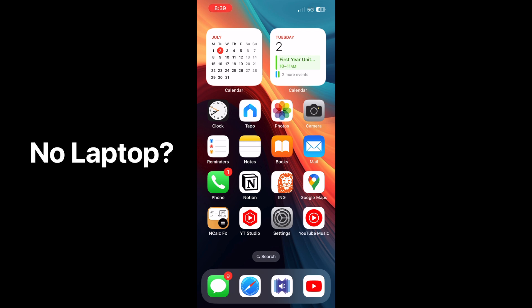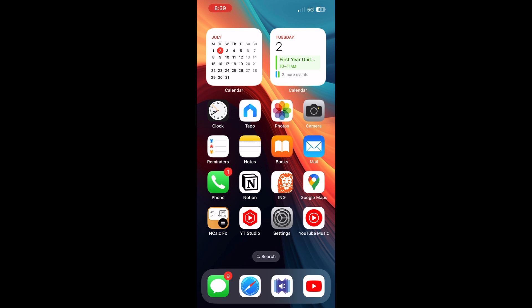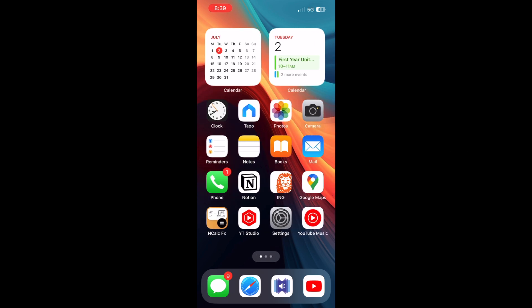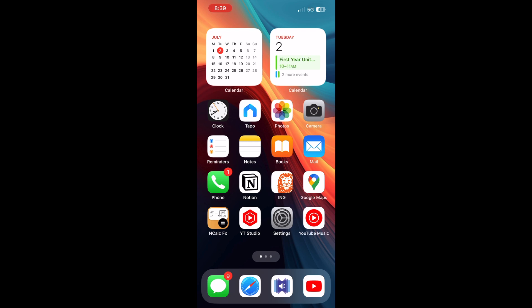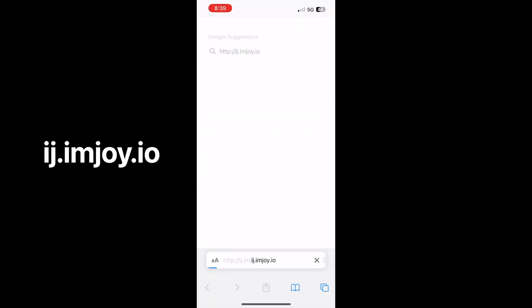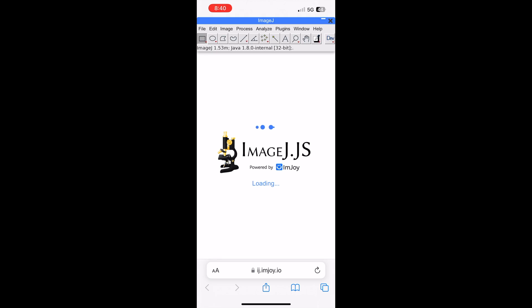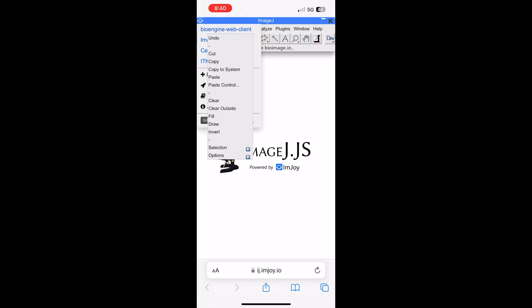All right, now if you don't have access to a laptop and you've just come with your iPad, there's still some hope. Now I don't have an iPad, so I'm just showing you this on my phone. So open up Safari and head to this link, give it a second to load. And there you have it. It's like a compromised slower version of ImageJ, but it does the job.